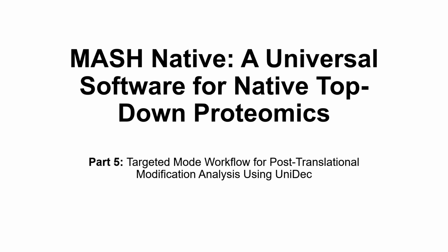My name is Melissa Pergandy, and I'm a postdoctoral associate in the Yang-Ga Research Group at the University of Wisconsin-Madison. In the following video tutorial, we will briefly cover how to add post-translational modifications, also known as PTMs, to a protein sequence in MASH native.